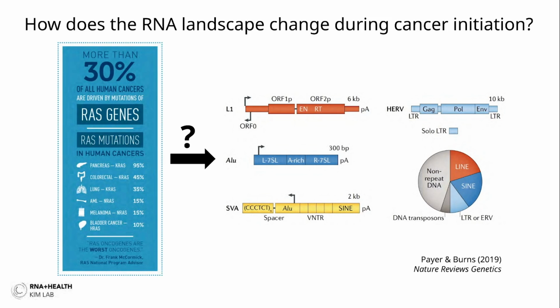The great thing about these retrotransposon sequences is that when they are transcribed into RNA, they're actually polyadenylated. So oftentimes when we generate these libraries that we sequence, for example, on the Nanopore platform, these are all there within the library, but oftentimes people don't really quantify this signal because it gives you these multi-mapping reads. But the nice thing about Oxford Nanopore's platform is that you get full-length information. This enables locus level quantification as well for some of these transcripts.